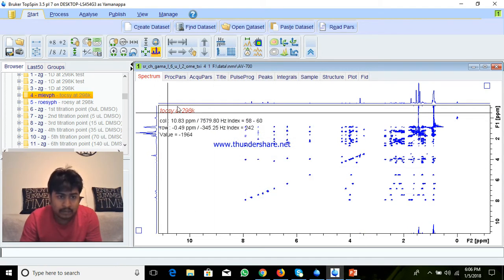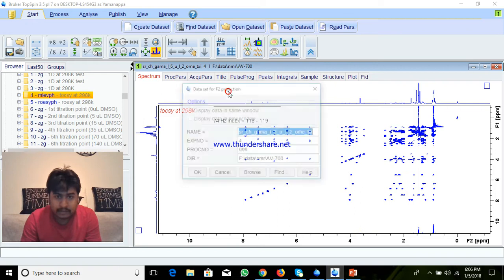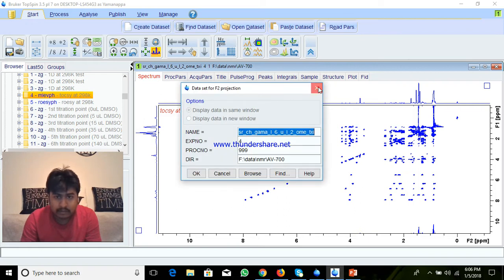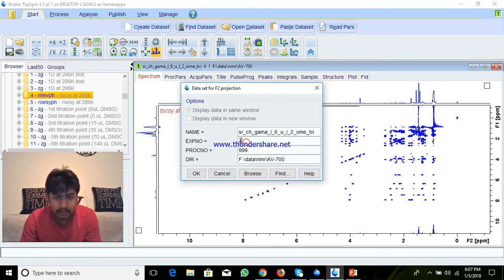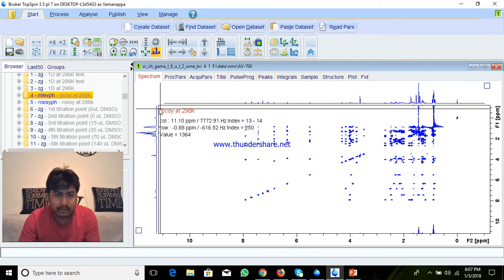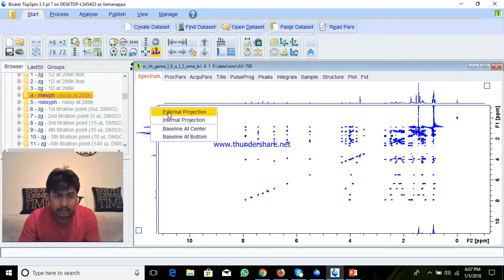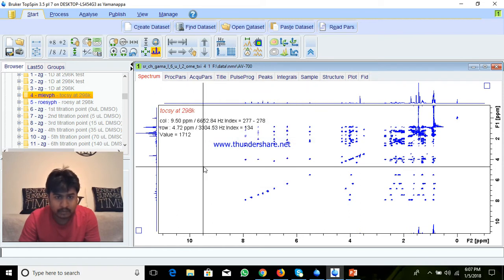After this, right-click here and Add External Projection. Right-click, External Projection, and we add — you can add the third one. Third is 1D — I am going to add third. And here also External Projection, here also I will give the third number, 1D, because here I have third number 1D. OK.